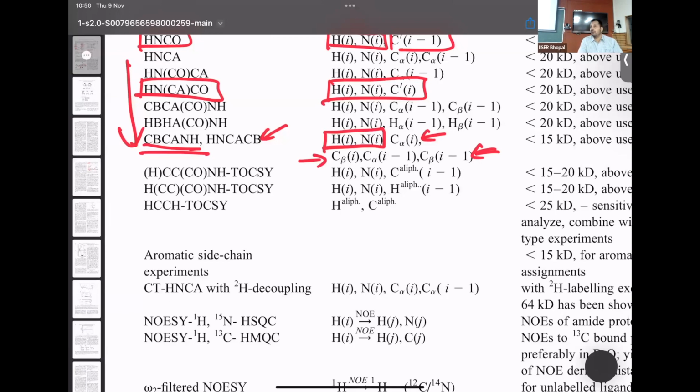The remaining 19 have. And the C beta is directly attached to other functional groups, like in phenylalanine and tyrosine. Therefore, the C beta chemical shifts will most likely not be degenerate between I and I prime, especially if they're not similar amino acids. Okay, within the same lysine, you might have trouble. Lysine has C beta, C gamma, many more coming up. So the C beta could still overlap.